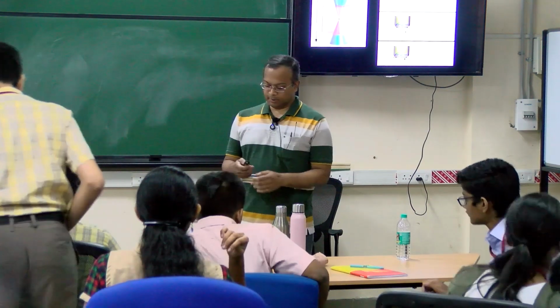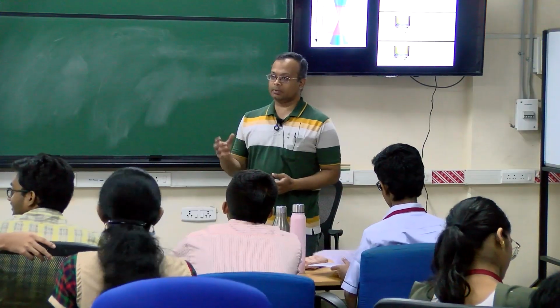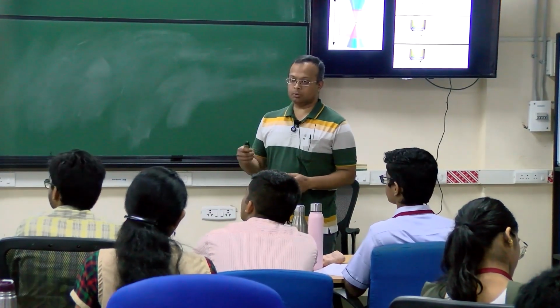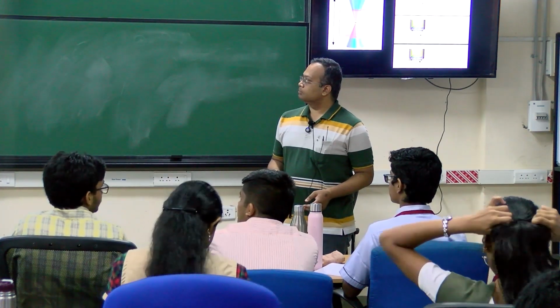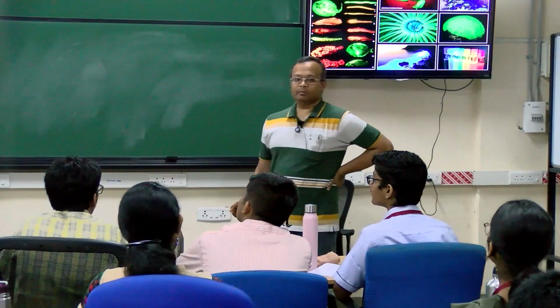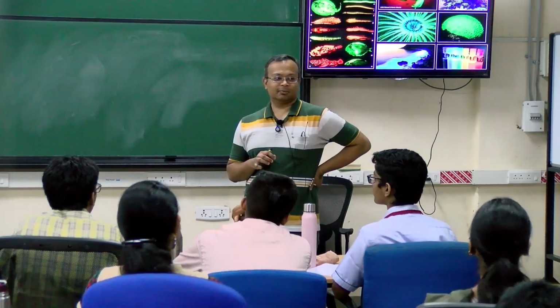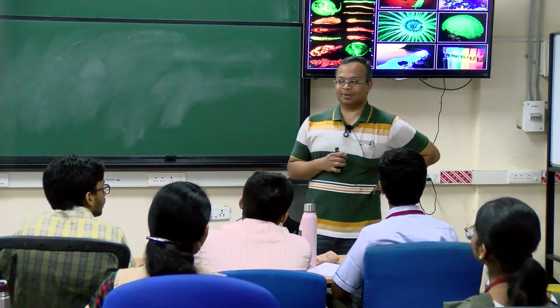So welcome back everyone. We will continue our lecture on the internal mechanics of the microscope, and I'll also introduce the concept of fluorescence as well. Okay. So coming to the concept of fluorescence, have you heard this term before? Yes. What is it? Glow in the dark. What else? What else do you know?